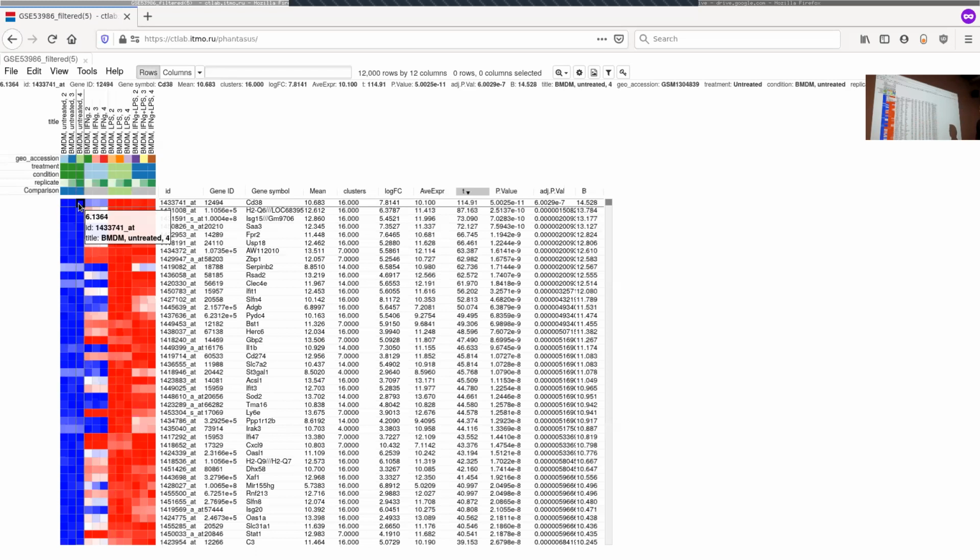Okay, and who knows what the AdjPval column is? Adjusted for multiple... Yes, it's an adjusted p-value, but adjusted for what? Multiple hypothesis testing. Yeah, the wording seems almost right, but there is a special word for this: multiple comparison.